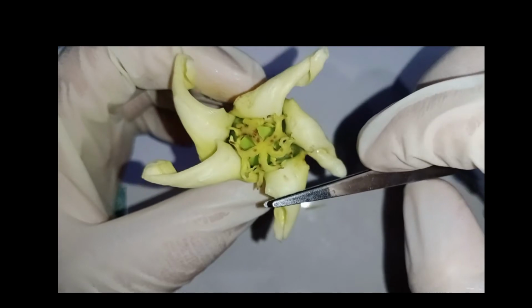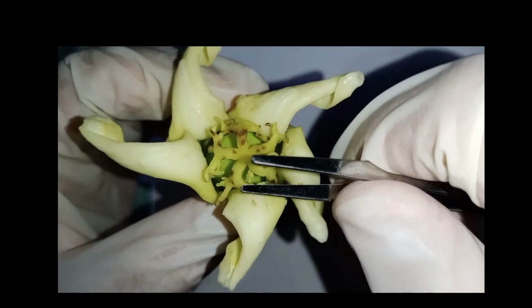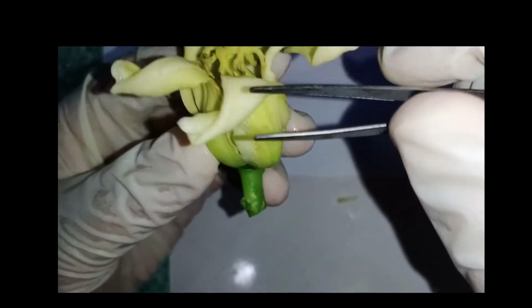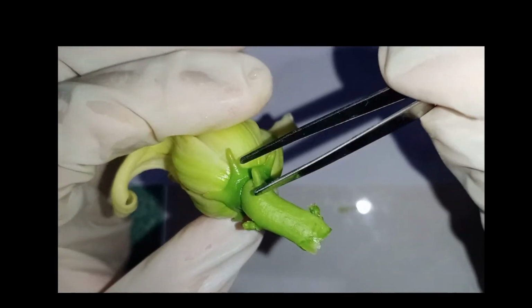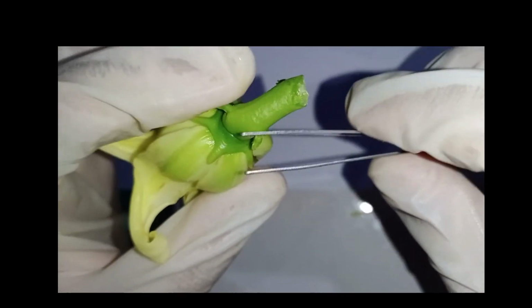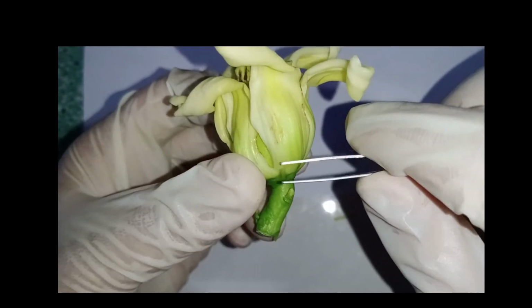The female flower has 5 petals with pointed tips here, and the stigma of the female flower has 5 branches here. Going down here, this one we call the sepal, which is a non-reproductive organ, and this one is called the receptacle. We proceed to pull out the sepal first.